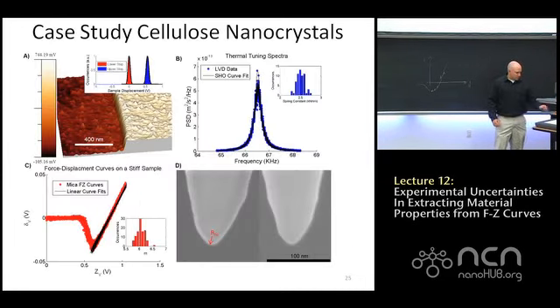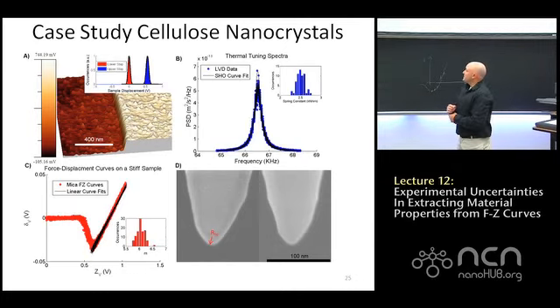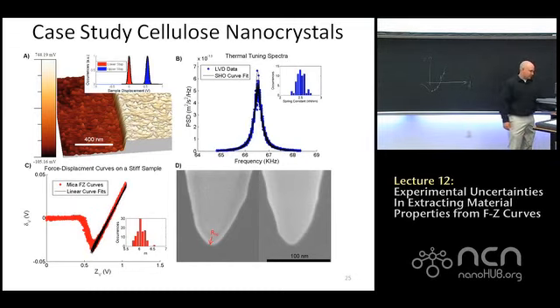So, what are the uncertainties in the inputs? This is just an example for four of the parameters, specifically CZ, KL, and M, because I'm trying to make them independent. This is a step height measurement of a sample where we know the height is 8 nanometers plus or minus 1.5 nanometers.